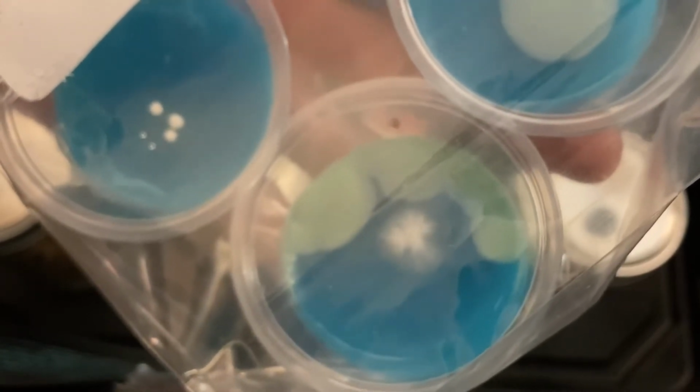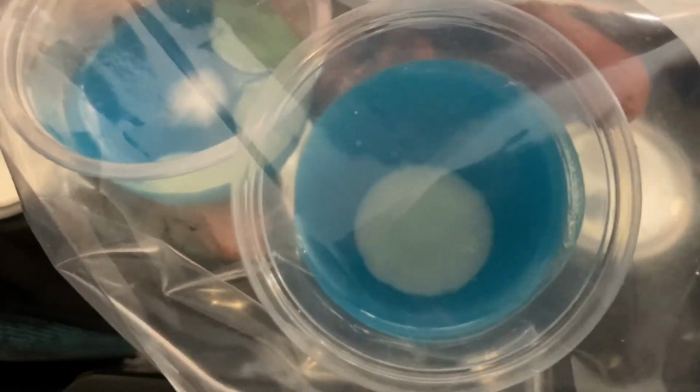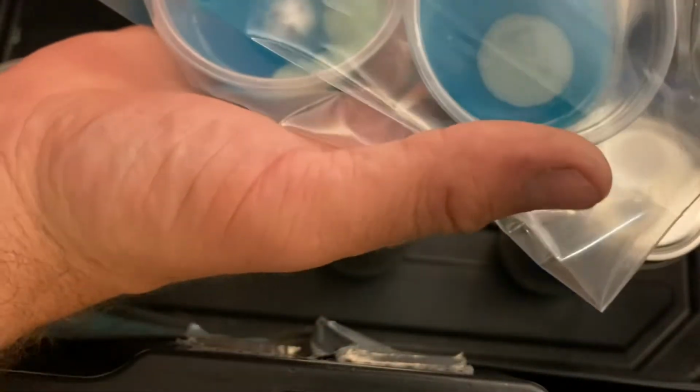So that first one has three little dots, and the way they've grown, I'm really not sure if that's mycelium or bacteria, but because it's white, it's most likely mycelium. Then we have this one that has all the green outside of it, but then the white spot in the center. So with a dish like that, you can actually isolate the mycelium that is healthy in a still air box, and then transfer to another petri dish and keep going like that to eliminate your contamination. And then we have this other one over here that has some growth in there, and it looks pretty white, but it's not rhizomorphic, so it's not the kind of mycelium I like to usually isolate, although not to say that that might not be good mycelium. So there we go. Those are the three that we did and put inside the bag since we were short on some lids.